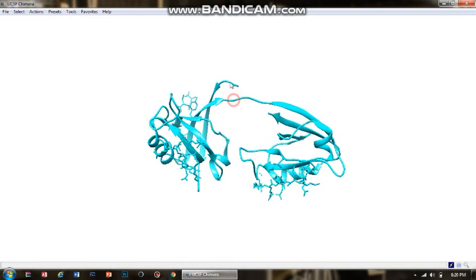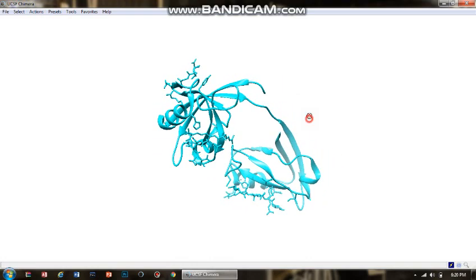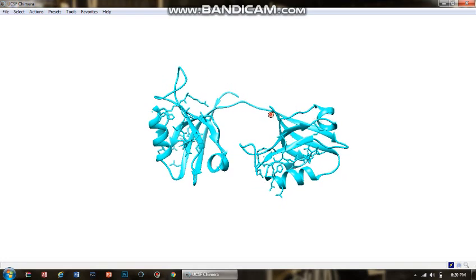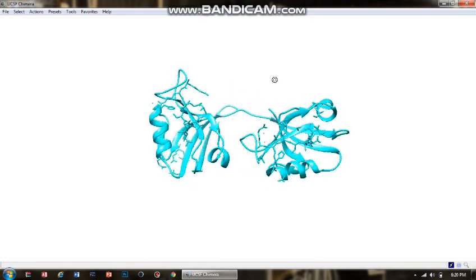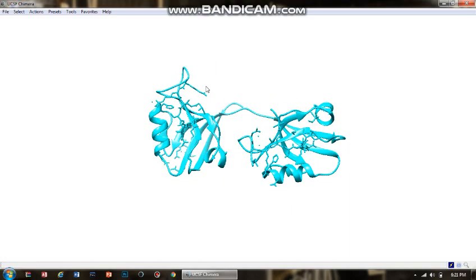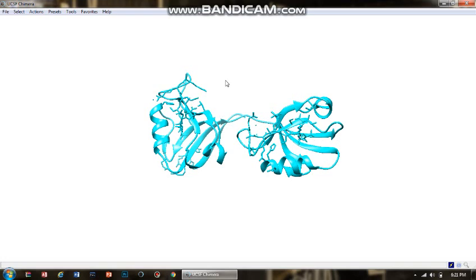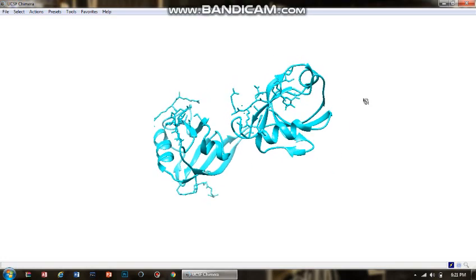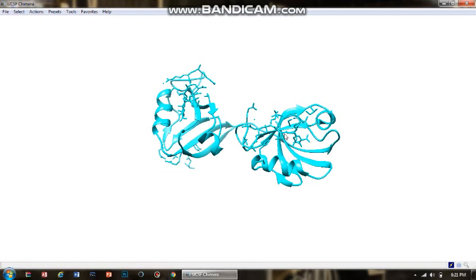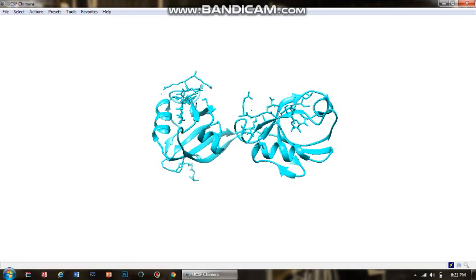If we select the rounded representation, this is the most common one we work with. It focuses on both the width and the height of the protein molecule. It sits somewhere between the flat ribbon and the edge representation, giving a very smooth, oval kind of effect.